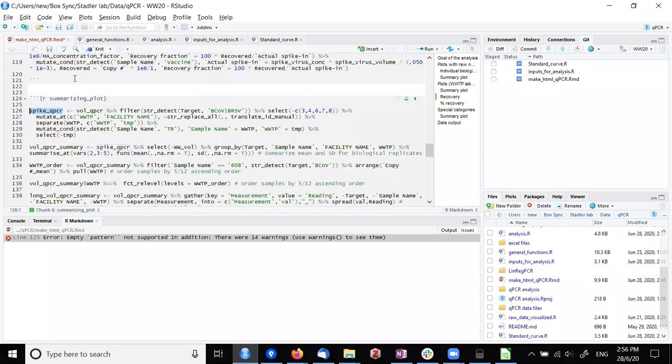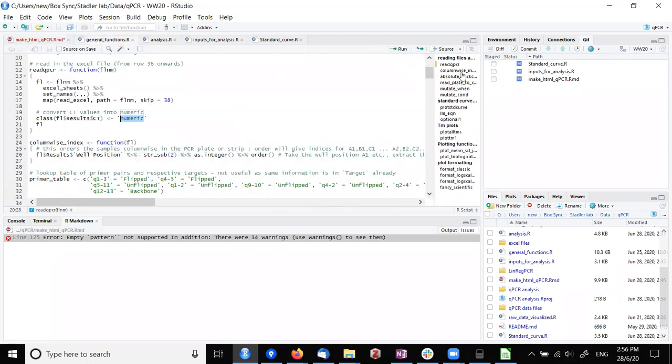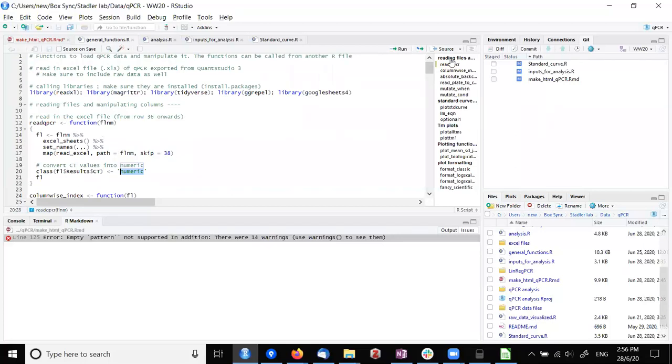If you see any errors, it tells you which line there is, and you just have to go and Google what that function is doing. The only thing is R has this neat feature. I load a bunch of packages here when I'm running my thing. These are called libraries. If there's any extra functions that are not there normally in R, you install them first, so it downloads to your computer, and then you load them with each run.